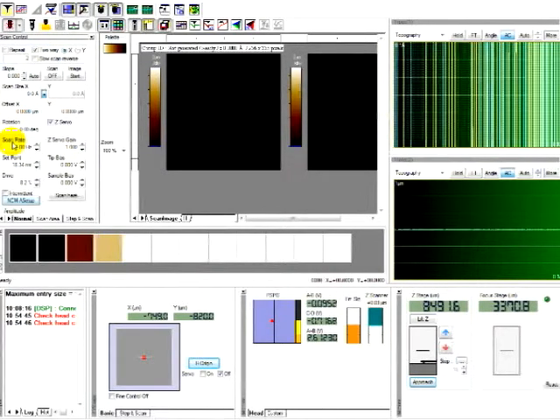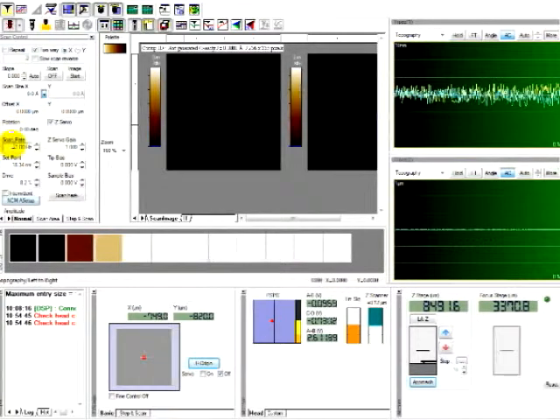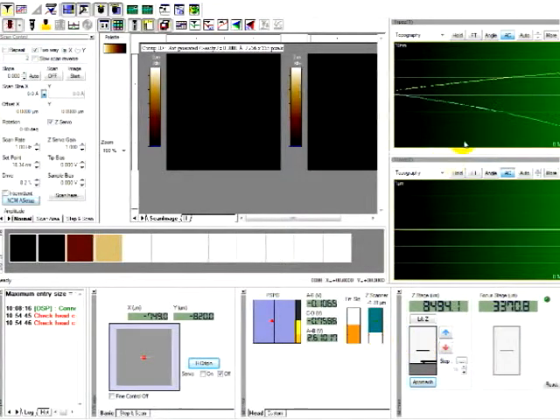In non-contact mode, there are three major parameters that we need to control. First, scan rate, Z servo gain, and set point. Set point is a little bit hard to control for beginners, so we have developed a new technique called double approaching, which is you approach it twice. First, you need to lift the Z stage, so the Z scanner won't be able to feedback any signals. There you go. There's still signal.